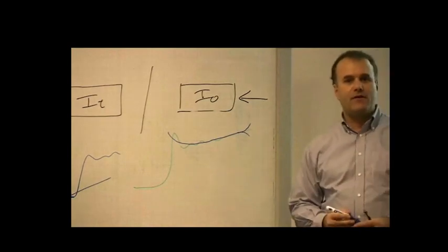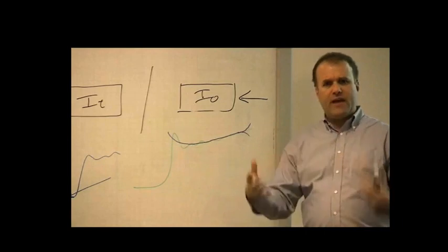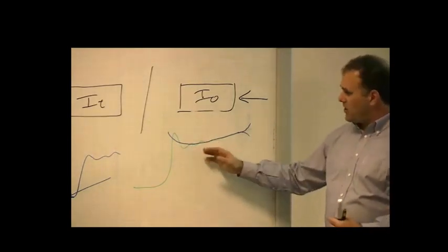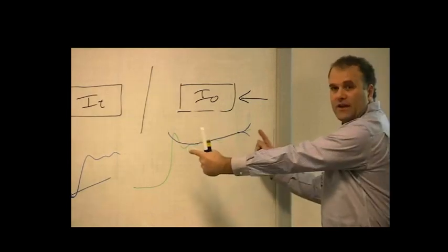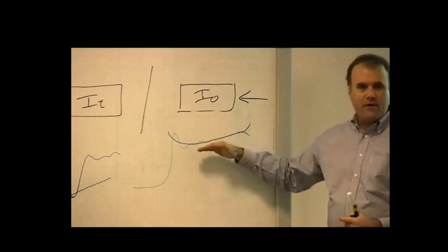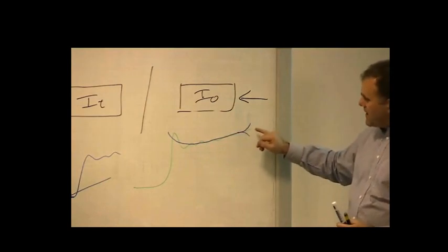And the reason is that a spline, by its nature, is well determined in the middle. That is, in the middle, where there's more spline on either side, the value of the spline is very well determined by the data, by having to go through the data. But at the very end, the spline is a bit ill-constrained.